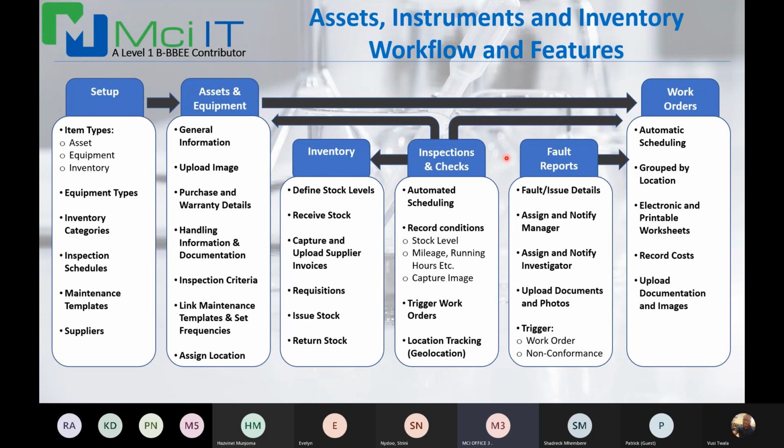Okay, so bear in mind we can set inspections and checks for each of these items, whether it's equipment, assets, or inventory. When it comes to inventory, I can obviously register my inventory the same way I register assets and equipment, define my stock levels. I have a function to receive stock. I capture and upload supplier invoices.